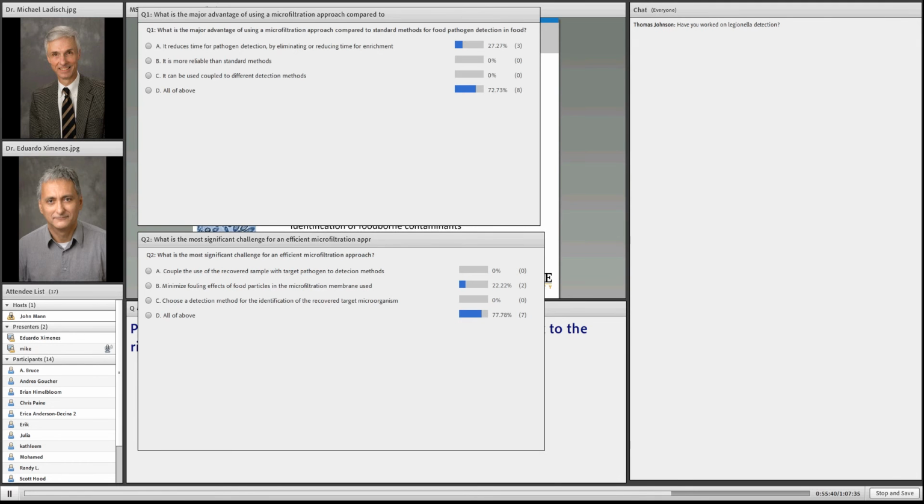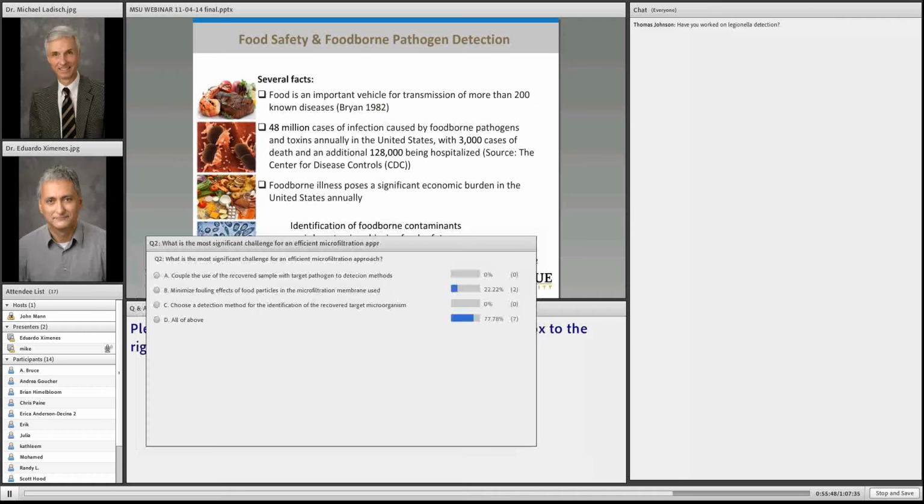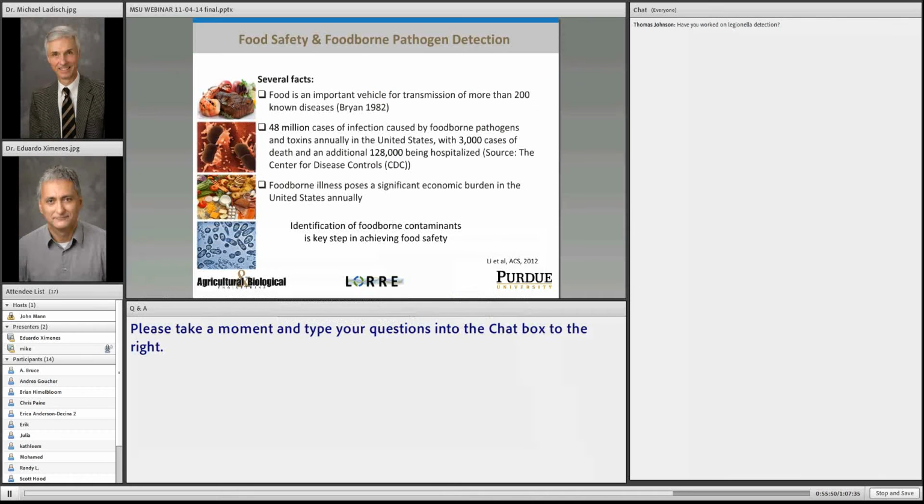We are familiar with the Innova Prep system, and that is a straight-through system. For those of you that have not seen it, if you go to their website, they have a really nice picture of it. But basically, this Innova Prep system, as far as we can tell, is effective and is similar to some of our earlier work where you had a flow-through method.